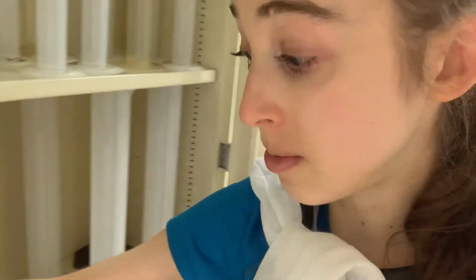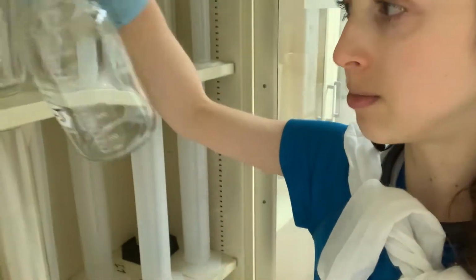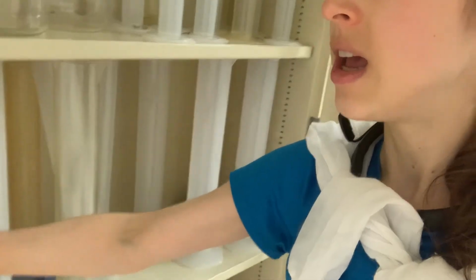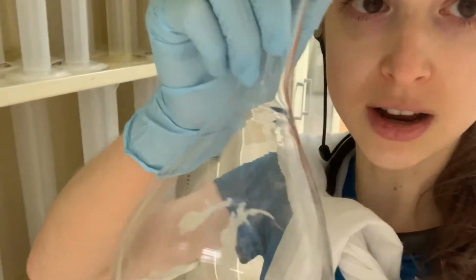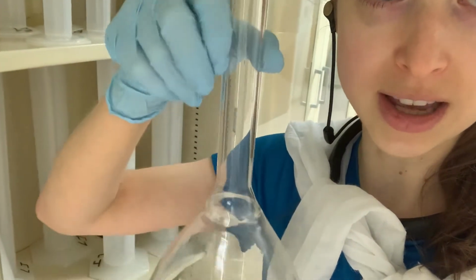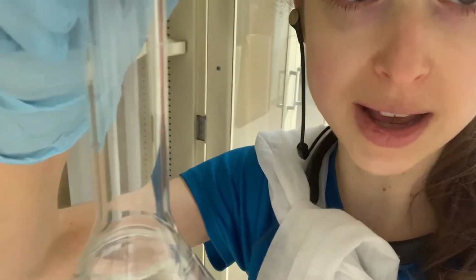So yeah, those are approximate volumes, and the lines on the beakers are approximate, and the ones on the flasks are approximate. Even the ones on the graduated cylinders are still not perfect. If you want super precise, there are things like volumetric flasks you'll use a lot in chemistry. We don't use them as much in biochemistry because we don't need to be that precise.